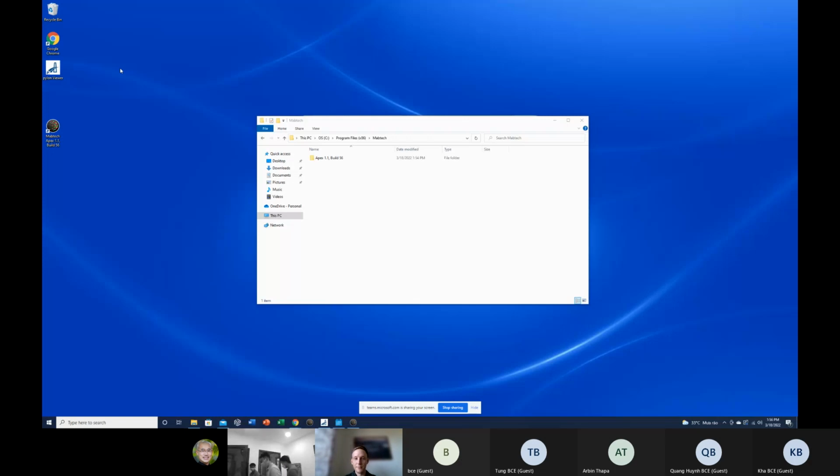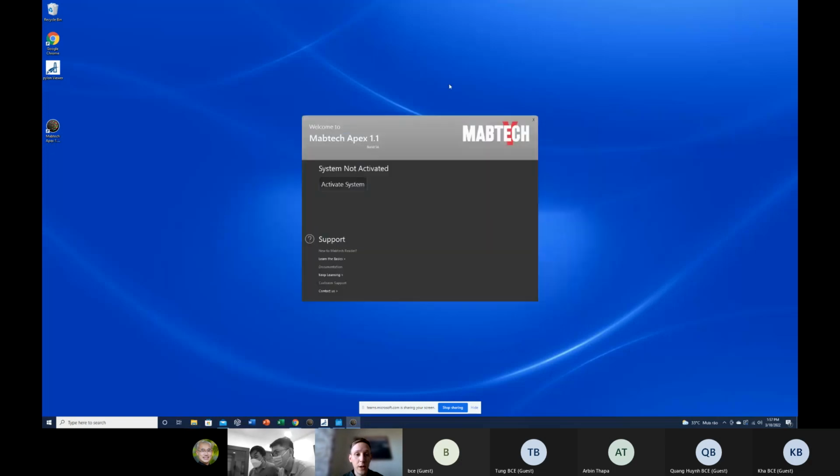Okay. Connected. And now we turn on the ASTOR. Okay. You can wait a little bit before turning on the ASTOR. You don't have to do it right away. So I just want to check a few things first. So you can close the window that you have now on the desktop on the computer.